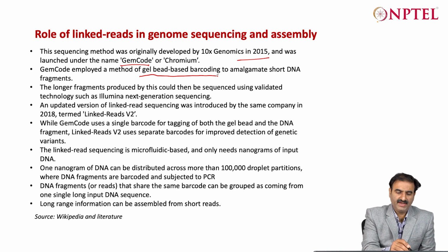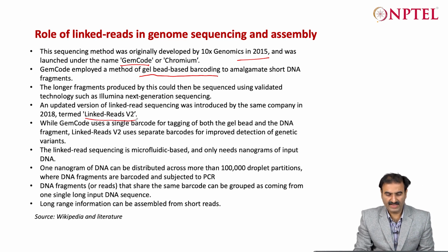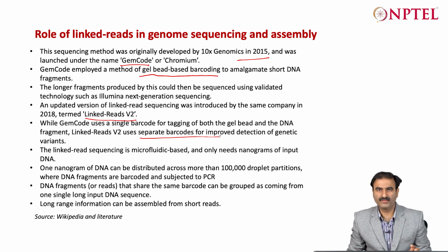Later on the linked reads V2 version also came, which employed separate barcodes for the beads as well as for the DNA to resolve better. Okay, and since it is a microfluidic instrument, you need very little DNA, about 1 nanogram, whereas another linked read technology, which is Tell-Seq, can use as little as 0.1 nanogram.